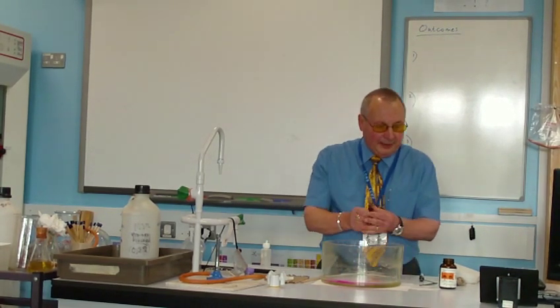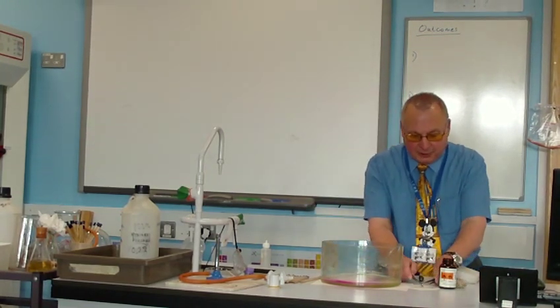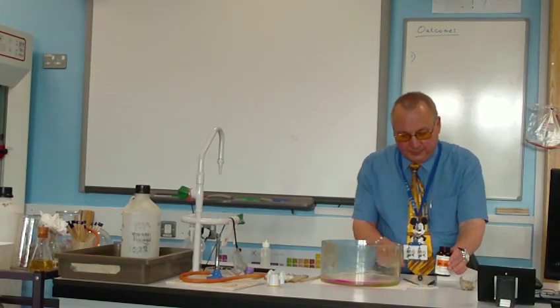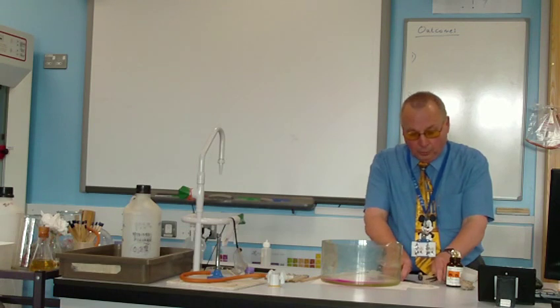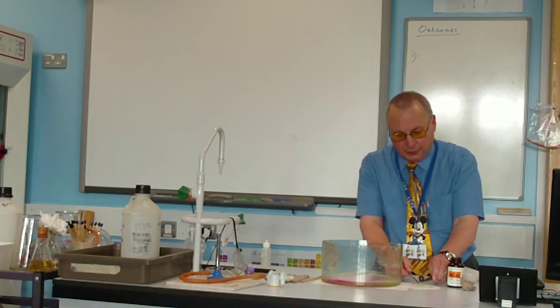So I'm going to repeat that experiment with sodium again. That's why I got 2 pieces. But this time I'm going to drop it on the filter paper, and the filter paper will stop the sodium going onto the water. What does water tend to do to things? If you burn yourself, what should you do?